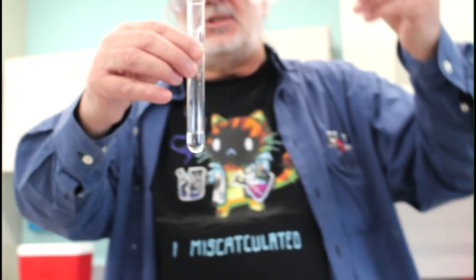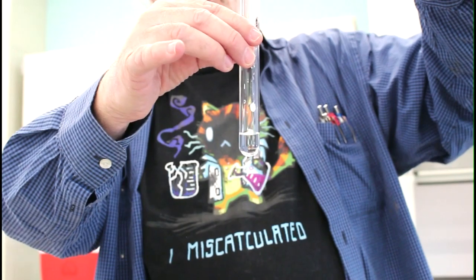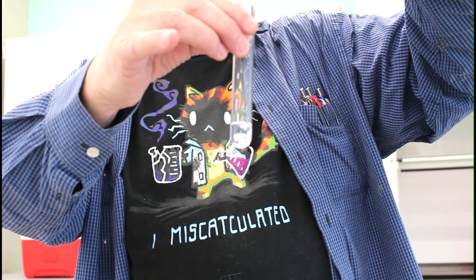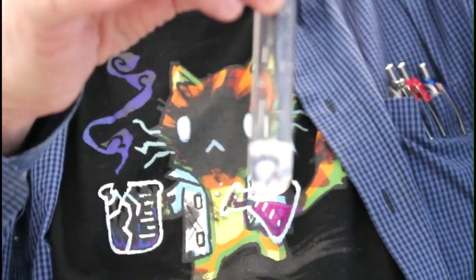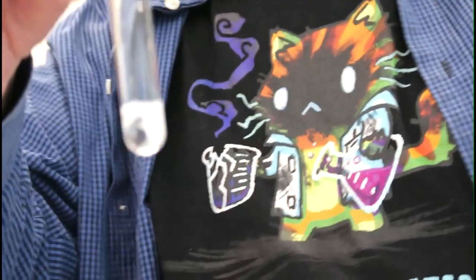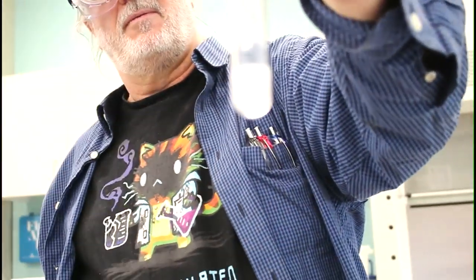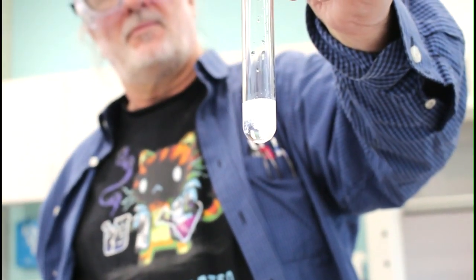And let's see what happens. 1 drop, ooh, there it goes. 2 drops. Oh, that's so cool. They're all my favorite, but I like that one. 4, 5. Well, what happened? Hold on, time out. Being funky again. There it goes. What happened?